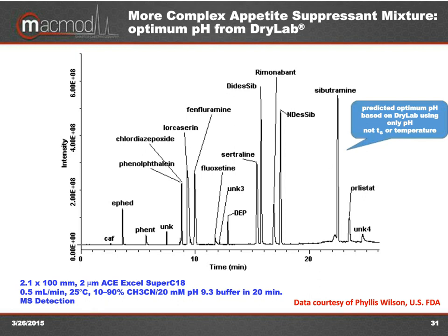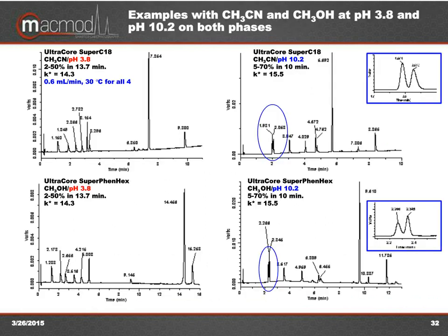Everything in chromatography and in life is a compromise. So you have to dial all those things together in terms of what your objective is versus what you want. You can get pretty peaks, but if you can't see them, it doesn't matter. Anyhow, I just wanted to go through that first. So I chose a few of the compounds from her sample set, which I described in earlier slides, and I thought I would do some experimentation here.